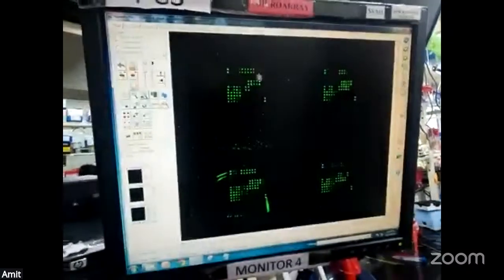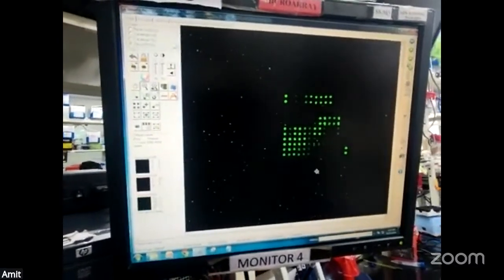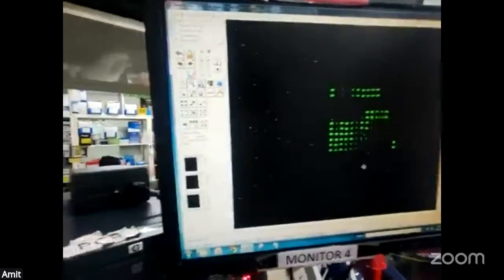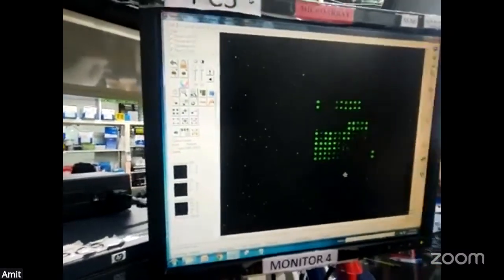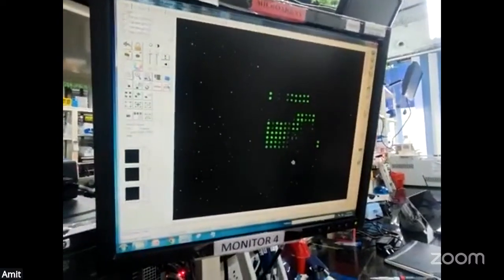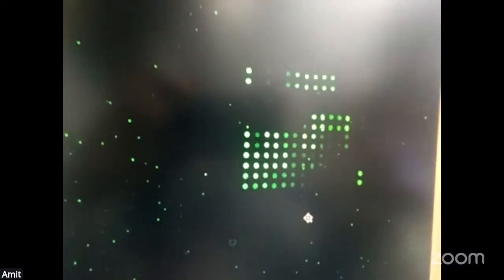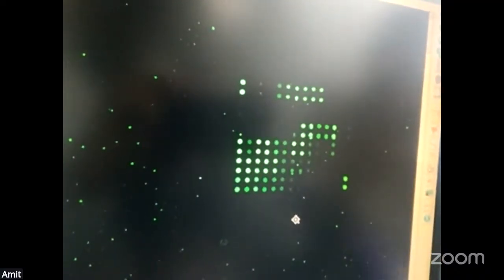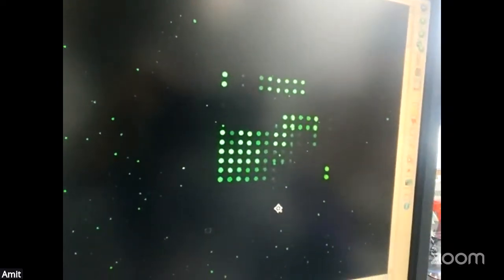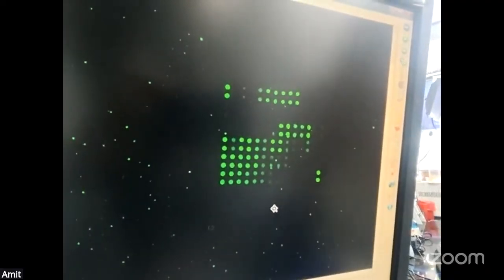We can see over here that these are the spots, which shows that the binding has happened. Over here, you can see some spots are very brightly lit, some spots are blurred. The brightly lit spots indicate a very strong interaction of the secondary antibody with the primary antibody. So it shows that the protein particular to that spot is present there. And the blurred spots show that they have no interaction or very little interaction. That means no proteins are found, or no interaction has happened in that spot.